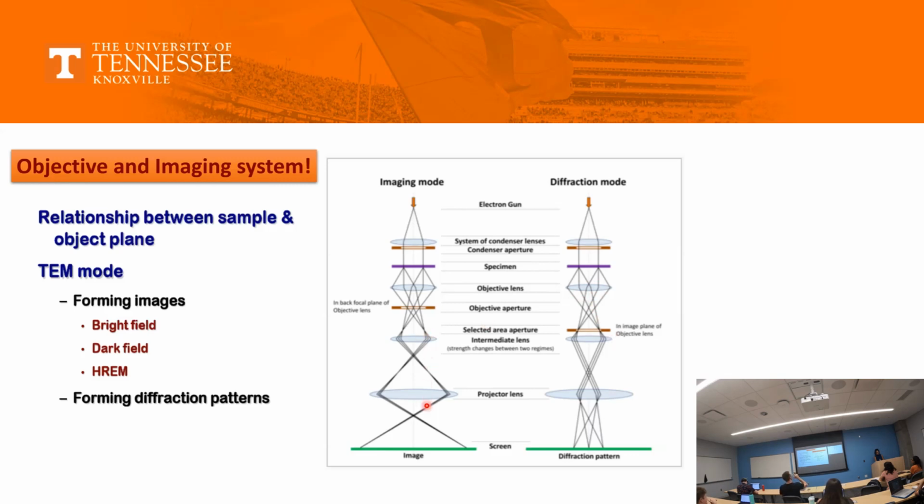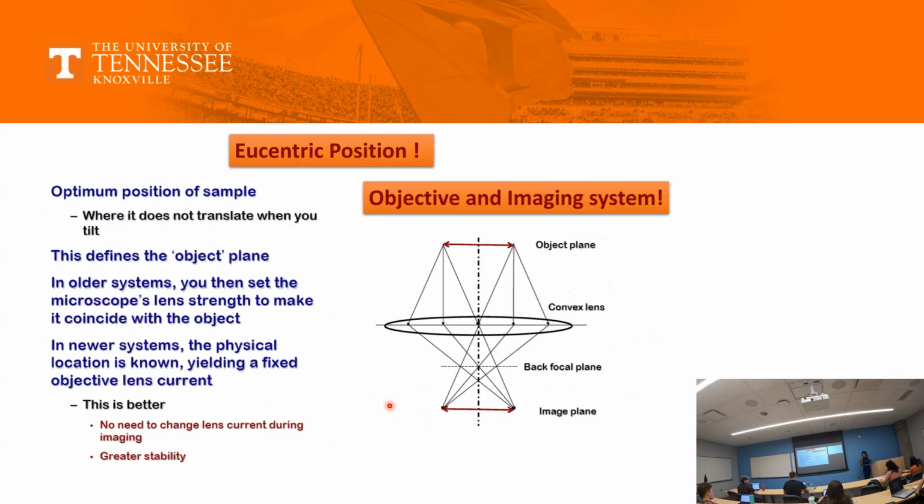Today we will learn a lot about diffraction, what diffraction is, and how it is helpful in forming and understanding images, and then what the different zone axes are, and also Kikuchi lines, if you have heard about them. So in the objective system, I'll get into the detail.